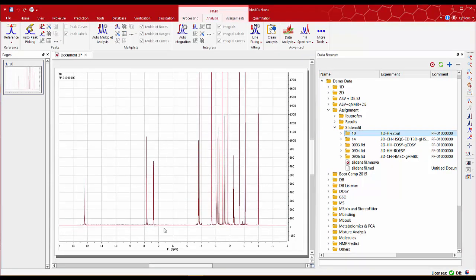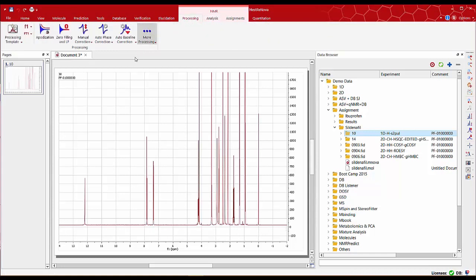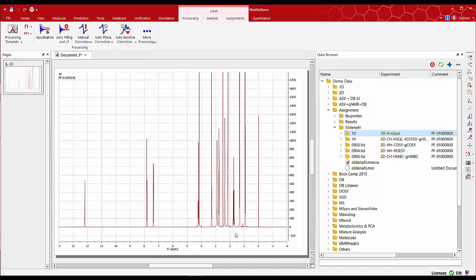We could improve the baseline. To do this go to NMR processing then apply auto baseline correction.